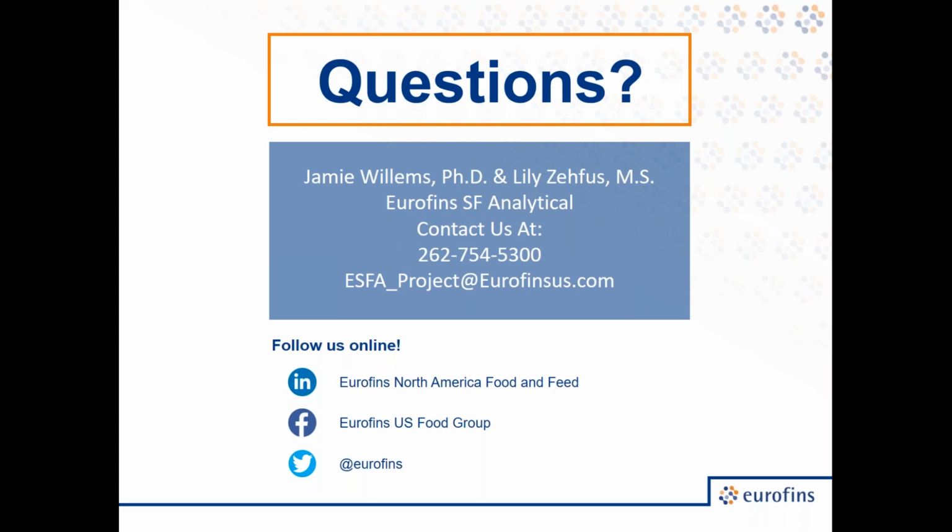Thank you. Our next question here is, does Eurofins ever couple sensory analysis with GCMS analysis to identify off flavors, off odors, or unusual mouthfeel in foods and beverages? So yes, we have used sensory panels.